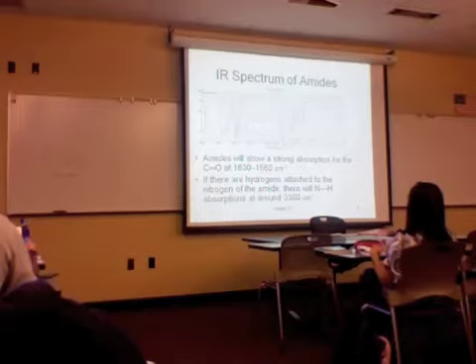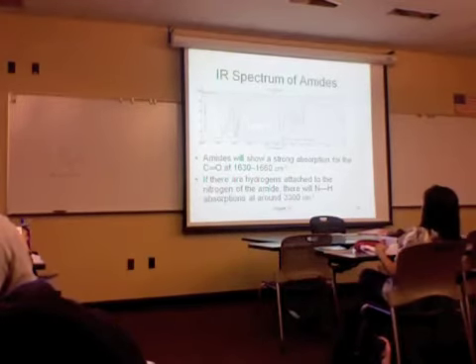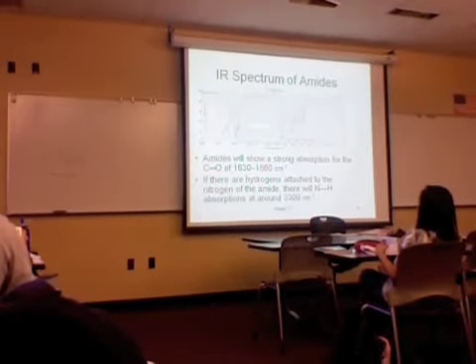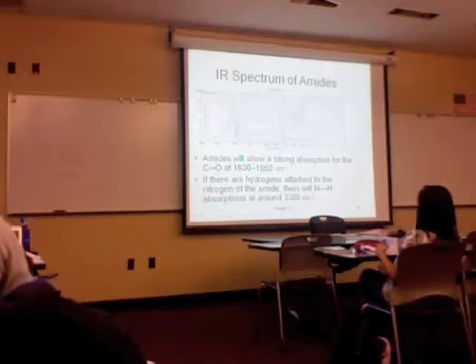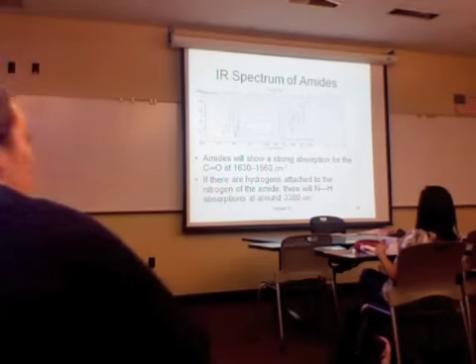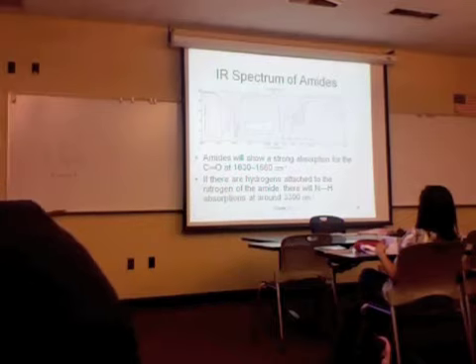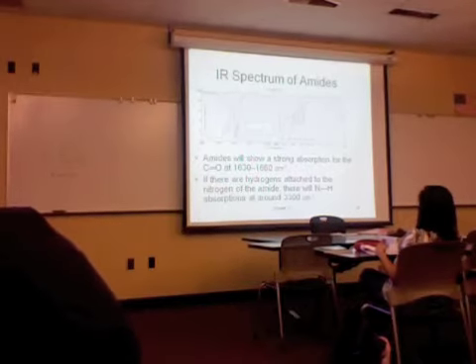The infrared, and we'll get to this in a moment, is largely valuable for diagnosing major groups, cataloging and categorizing your unknown compound in a certain general area. Very rarely can you take an IR and say, oh, this is such and such a compound. There are IR spectroscopists that can, but they're professionals and they do this for a living.